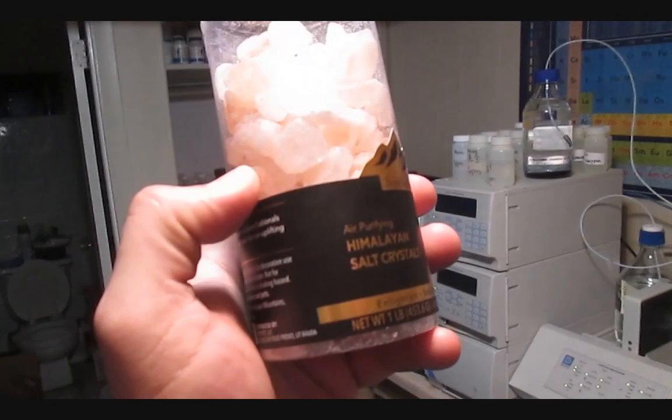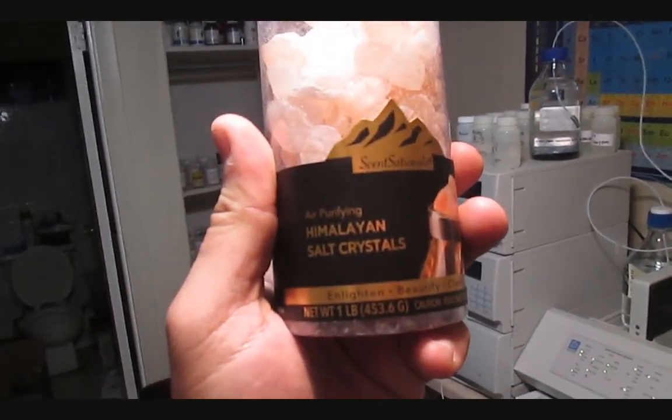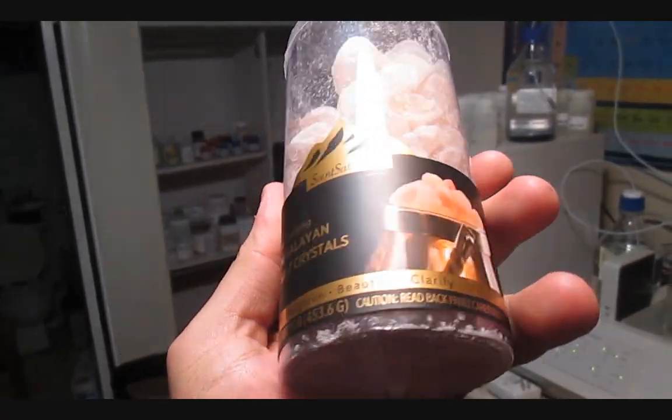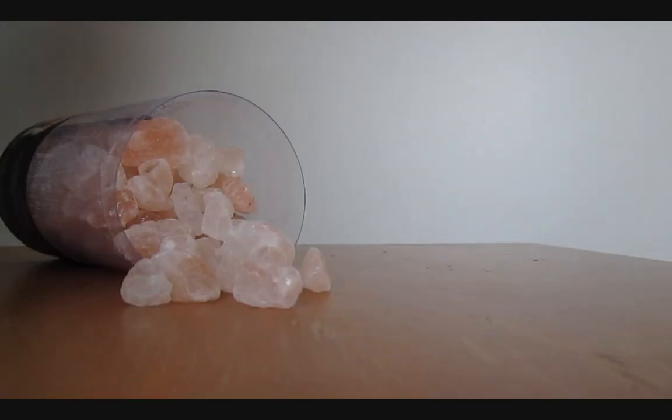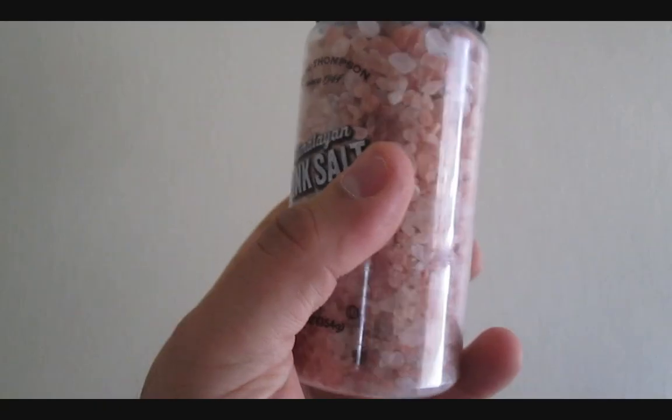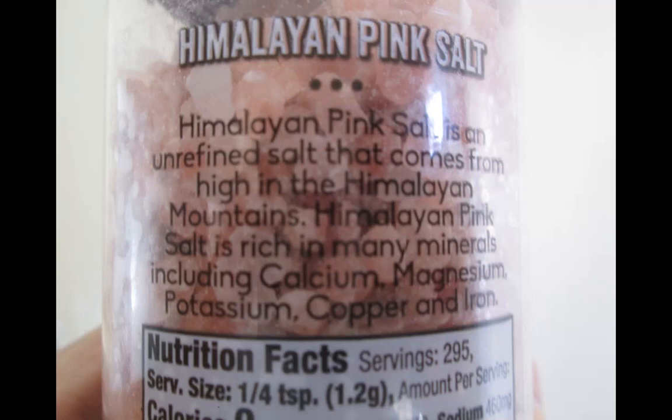I came across this Himalayan salt claiming to purify the air, lift the mood, promote energy, and give natural elegance. I don't know what any of that means, but these look like larger crystals of pink salt. Those are advertised to contain calcium, magnesium, potassium, copper, and iron.